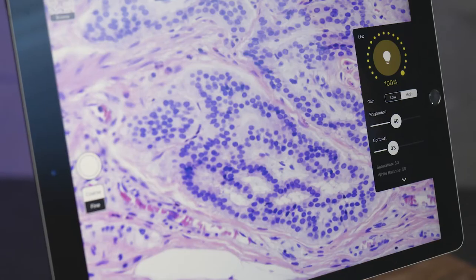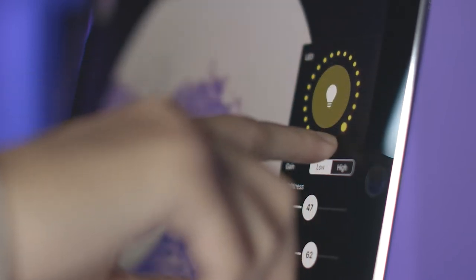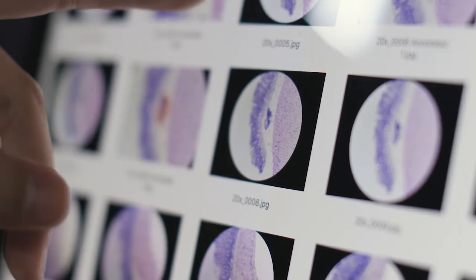Traditional eyepieces have been replaced with Apple's state-of-the-art iPad Pro. Our intuitive software makes viewing your samples incredibly easy and helps provide a more collaborative approach to your work.